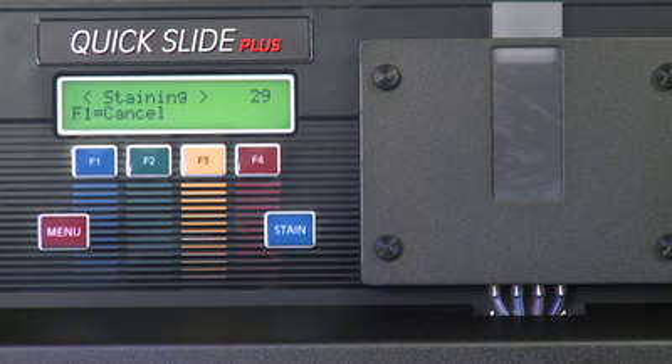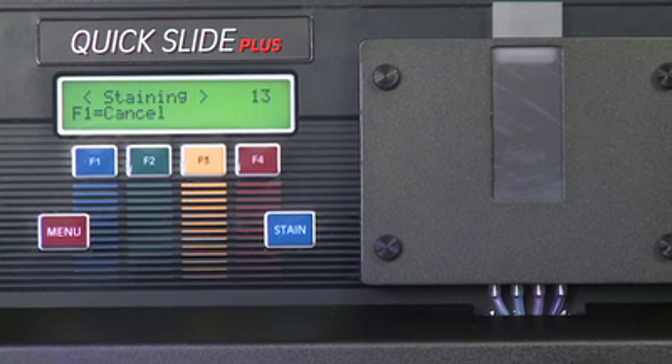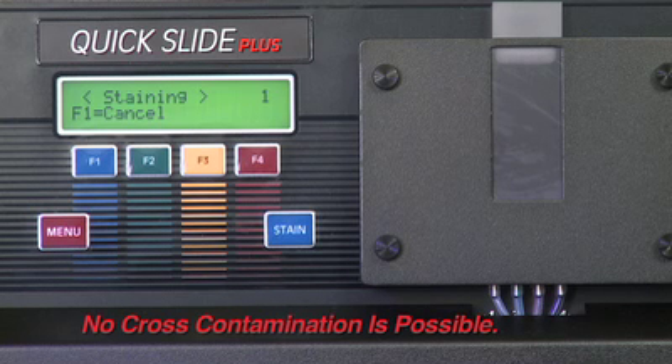The stain process is now underway. Quick Slide stains peripheral blood smears in one minute with no prefixing required. Bone marrow slides need to be prefixed with a quality methanol. Stain and buffer times are independently adjustable for operator preference up to 4 minutes and 25 seconds each. No cross-contamination is possible, as with hand-dip or spray-type stainers.